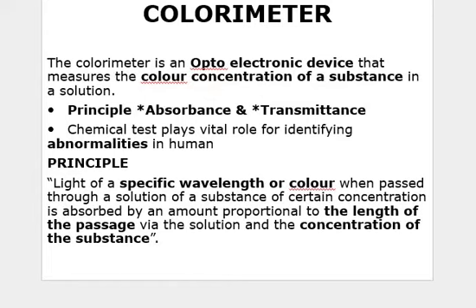This colorimeter is an optical electronic device that measures the color concentration of a substance in a solution.